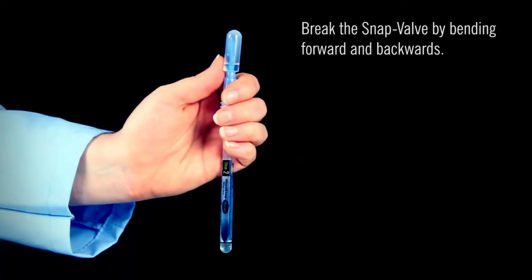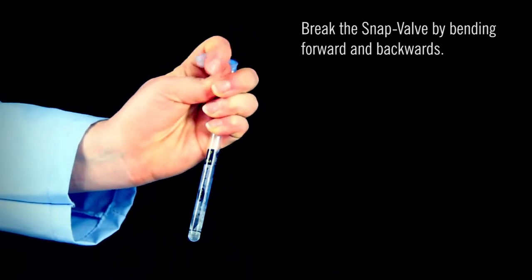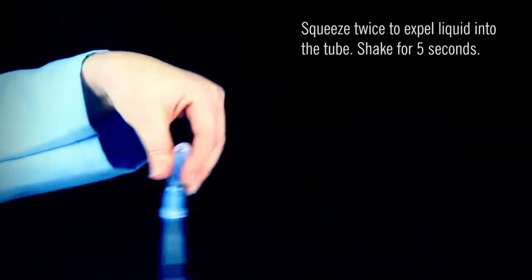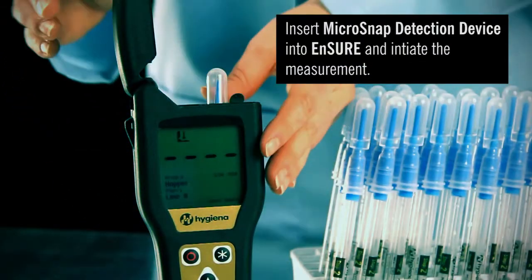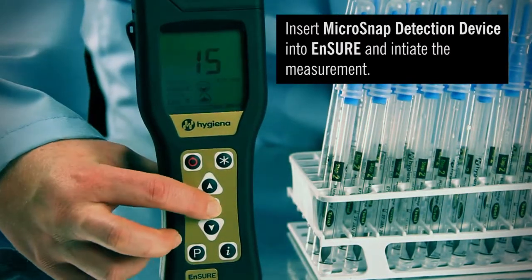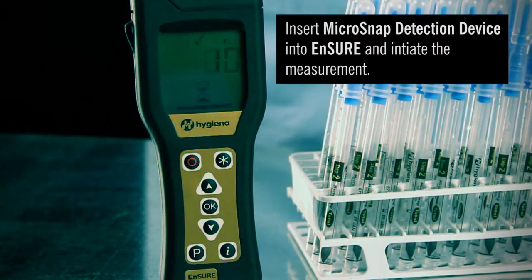Hold the device in your fist and use the thumb and forefinger to break the snap valve by bending the bulb forward and backward. Squeeze the bulb twice to expel liquid into the tube and shake for 5 seconds. Immediately insert the MicroSnap detection device into the read chamber. Close the lid and press OK to initiate measurement. Results will be displayed in 15 seconds.